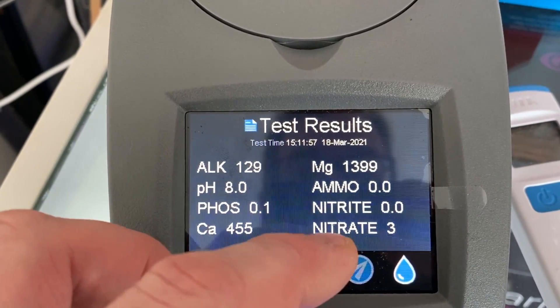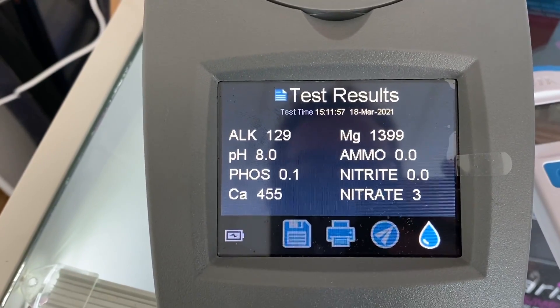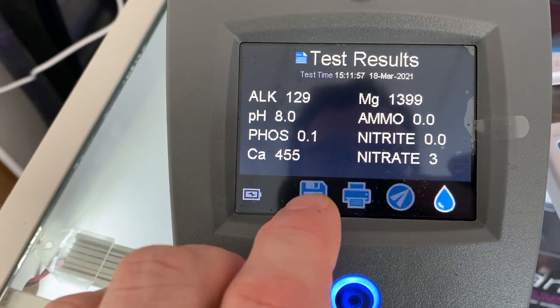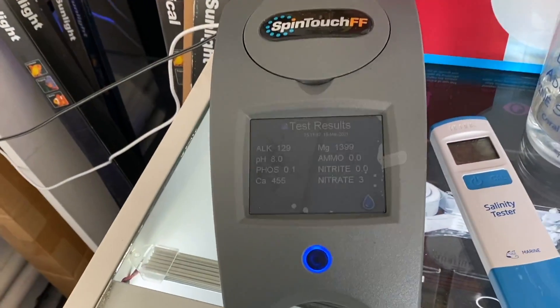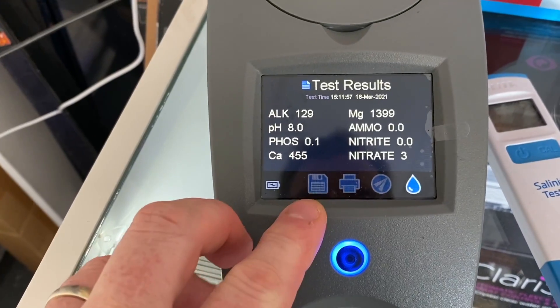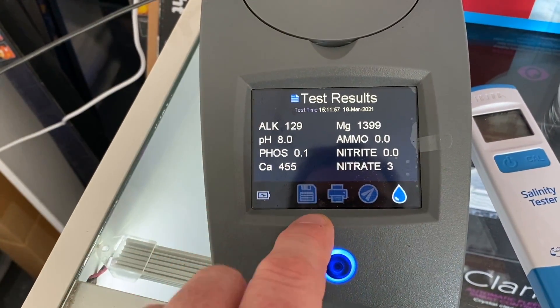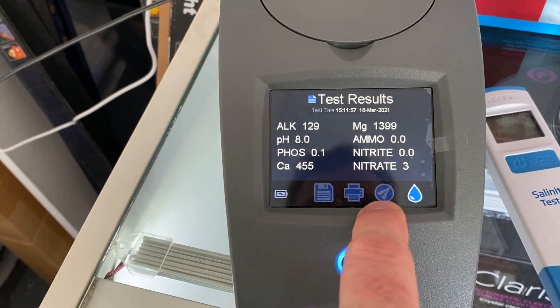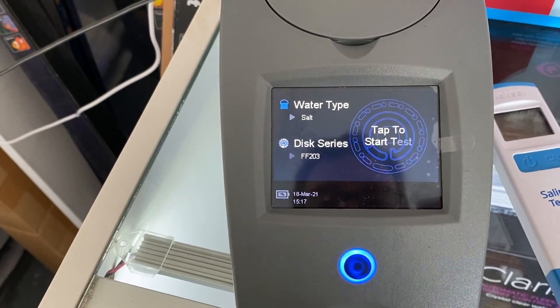No ammonia, no nitrite, and three nitrates — exactly where I like things, so pretty happy with those results. When it's connected to a computer you can actually save those results to a file with a date and time stamp, print them out for the customer, email them to the customer, or just press the menu button to head back and get ready for the next test. Pretty simple little device: load the water up, press the button, come back two minutes later for your results.